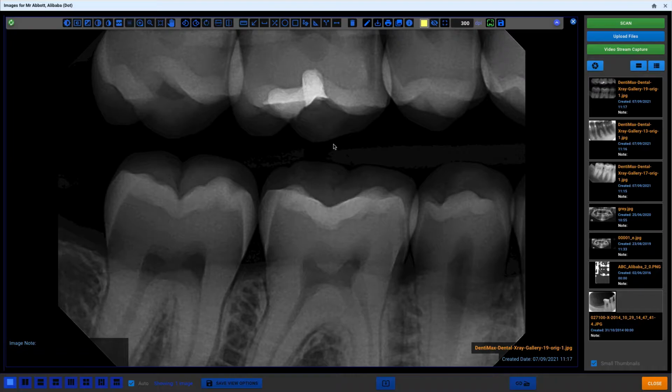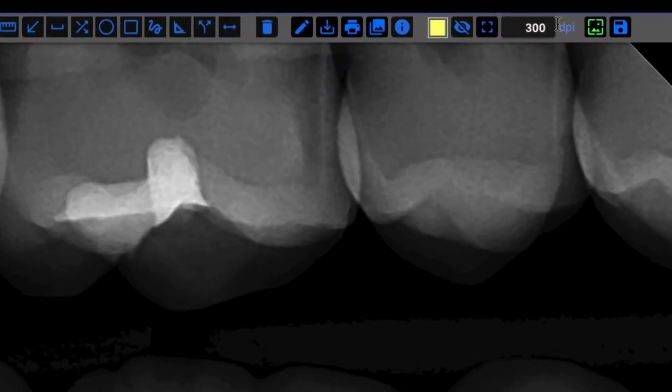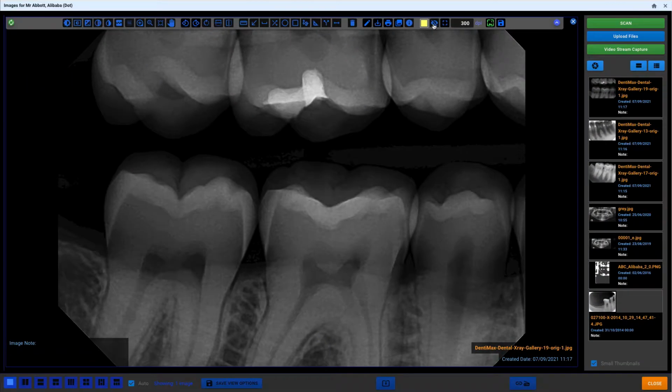That is normally sufficient. However, if it did not happen or the image was acquired from a different source, downloaded, exported from another software, emailed, etc., then the calibration of the image must be performed to ensure that the measurements are correct. Essentially, the calibration is measuring an object of a known size and calculating the right parameters from this measurement. Praktika provides two methods of how that can be done. The first method is entering the correct known resolution of the image. The second method is using the calibration tool to measure an object of a known size in the image.